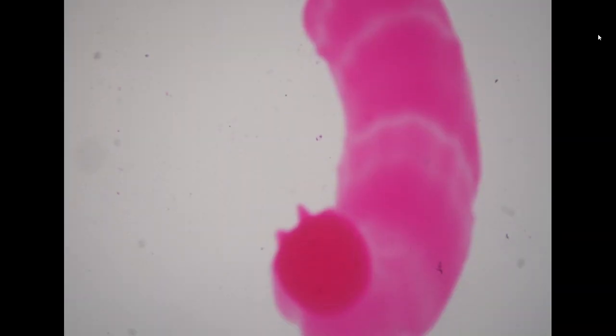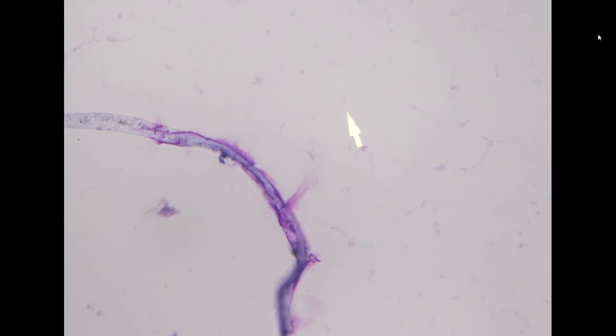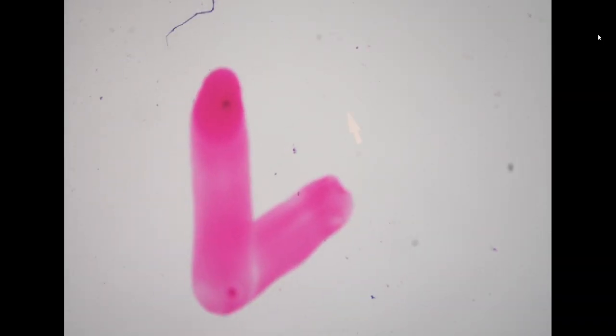So the next specimen is a CSF specimen. The patient had a past history of lung adenocarcinoma. So there were very scant cells in the CSF specimen, but the cells definitely show enlarged nucleus and eccentric nucleoli. Here is a cluster. And here is also more pleomorphic and eccentric nucleus. So this is positive for metastatic adenocarcinoma.